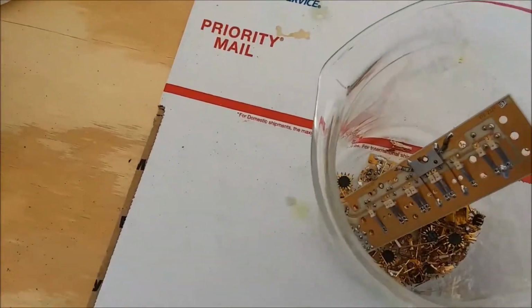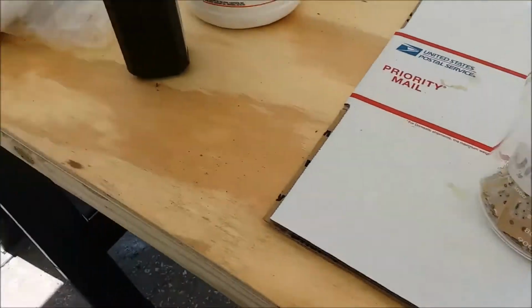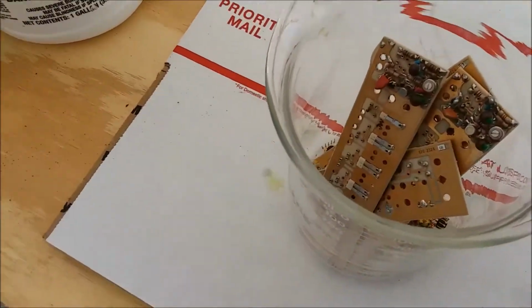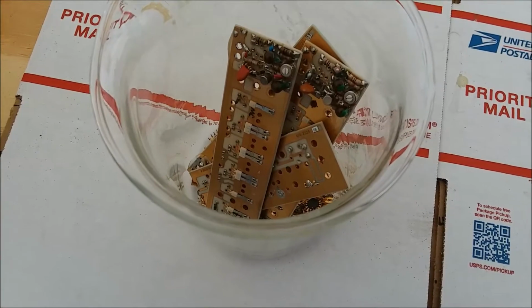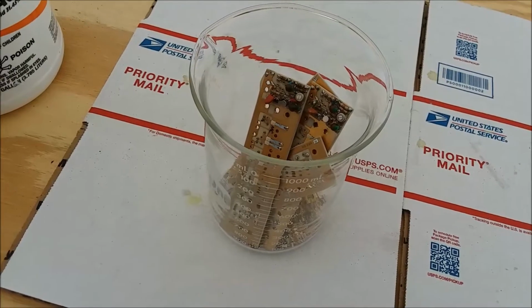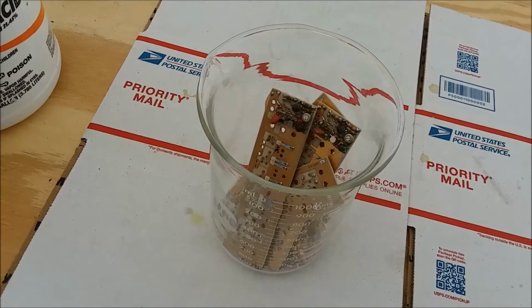So I think what I'm going to do is just try a base metal extraction first. I'm going to put it all in a beaker and fill it up with a mixture of muriatic acid and hydrogen peroxide, and see if I can strip as much of the base metals off this stuff as I can before I try and dissolve the gold, just to try and keep it a little cleaner. Because there's a lot of base metal in there, and I'm not sure how much gold there is. Maybe not much, and it's going to be really hard to precipitate the gold out of all that metallic sludge. So I will try to just dissolve the base metals first, and then see how much gold I can get after I clean these parts up a little bit.